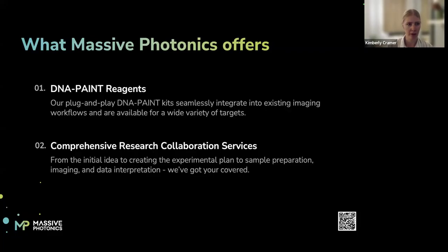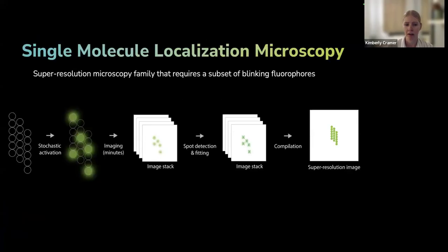So now to the talk. First, I want to put DNA paint within the wider super resolution microscopy context. DNA paint is a single molecule localization microscopy. It's part of that family, the SMLM family.